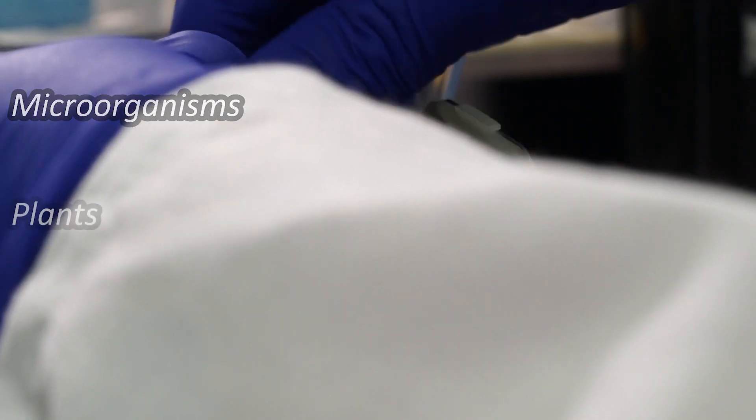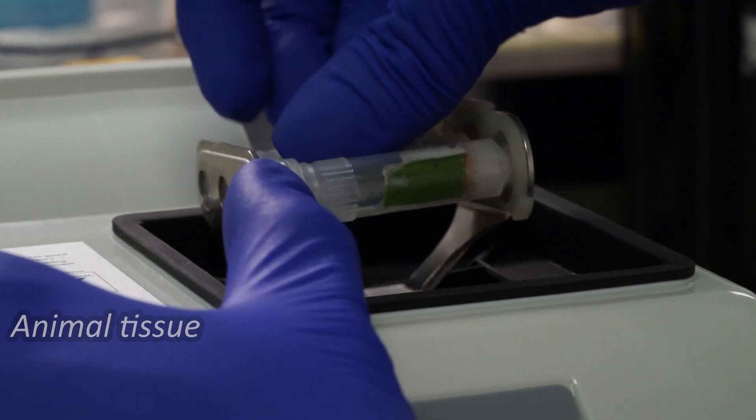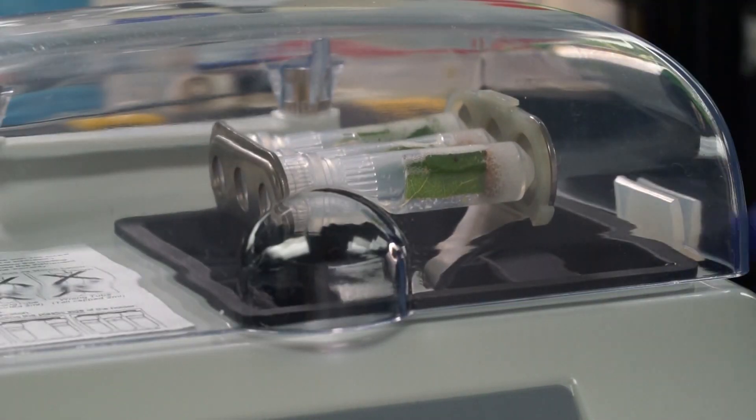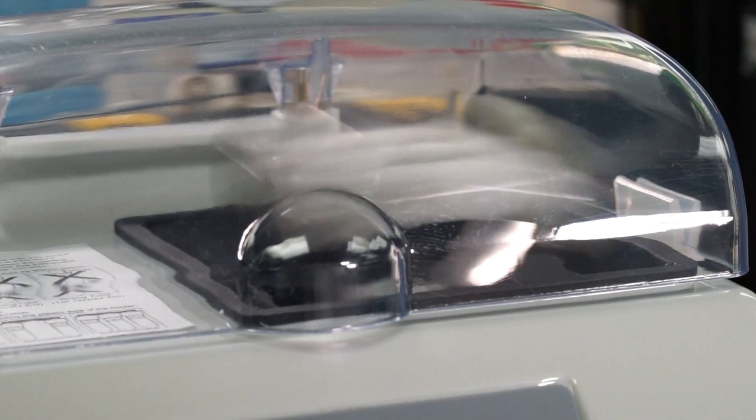Microorganisms, plants, and small pieces of animal tissue can all be homogenized in an arcing motion at a top speed of 4000 rpm and a minimum of 2800 rpm.